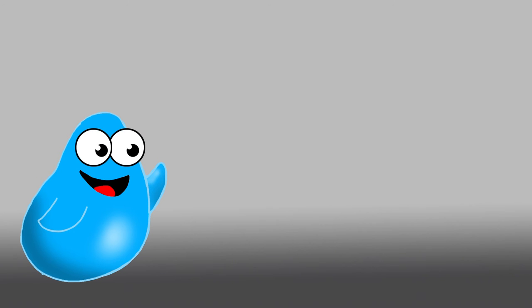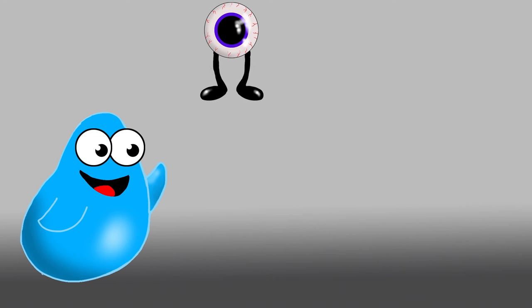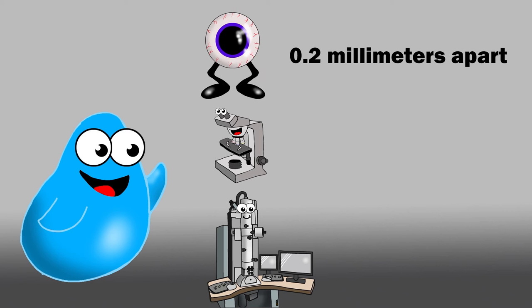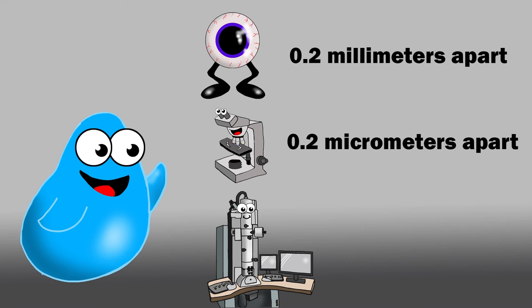Now, to give you some perspective on resolution, let's compare the resolution of the human eye, a light microscope, and an electron microscope. With the human eye, objects must be at least 0.2 millimeters apart to tell that they are separate. Light microscopes have a better resolution than our eye, and they let you see things as small as 0.2 microns. That's 1,000 times smaller than what you can see with your eye.